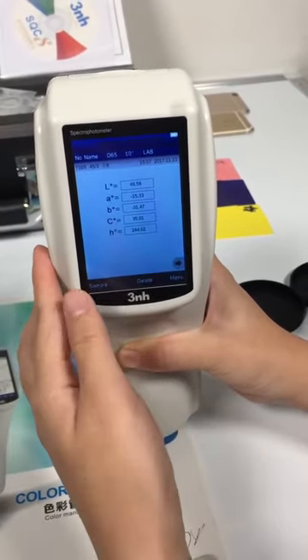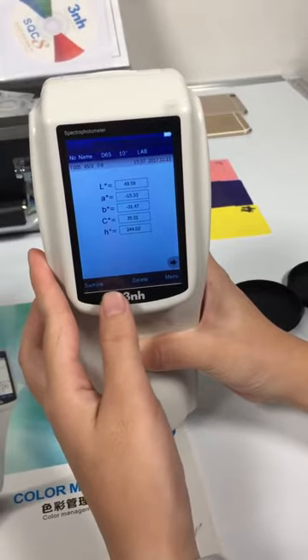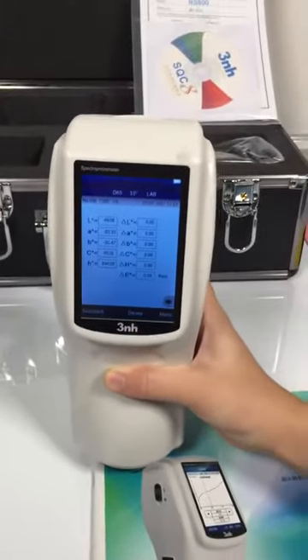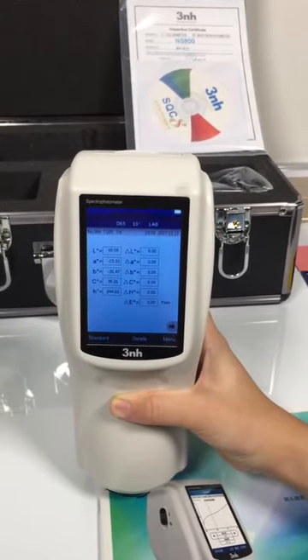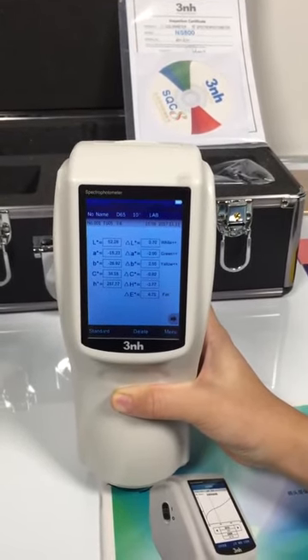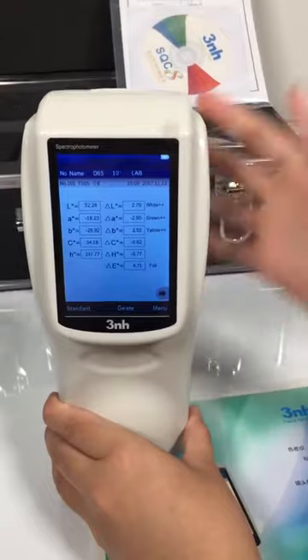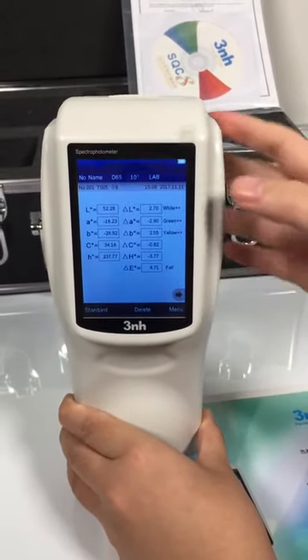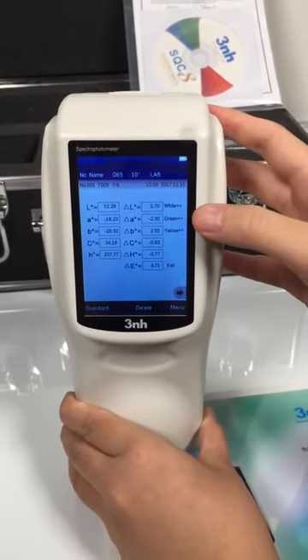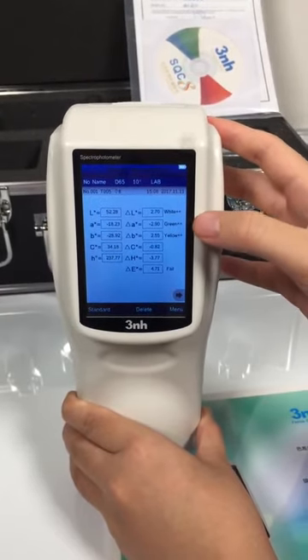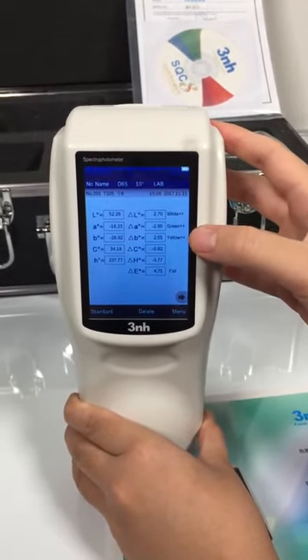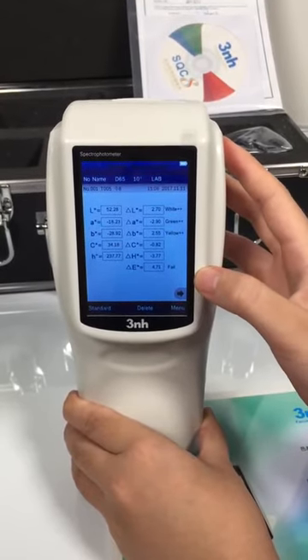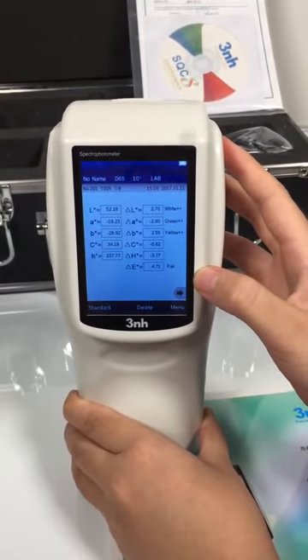Then we switch to the sample testing. We can see the results — comparing with the standard, the sample is more white, more green, and more yellow. The delta data means the color difference between the standard and sample.